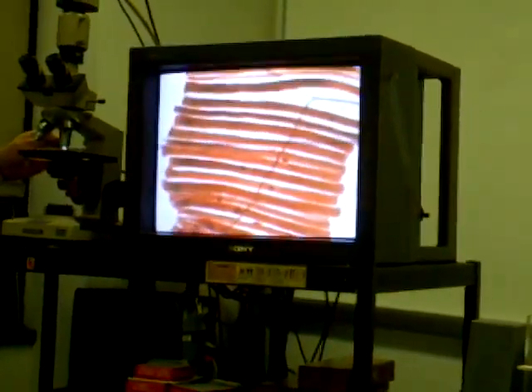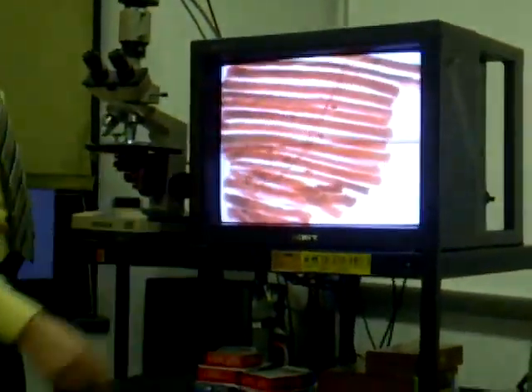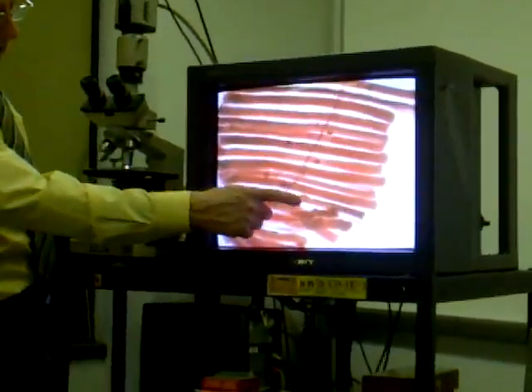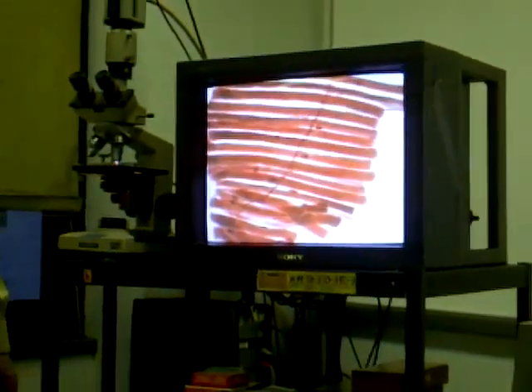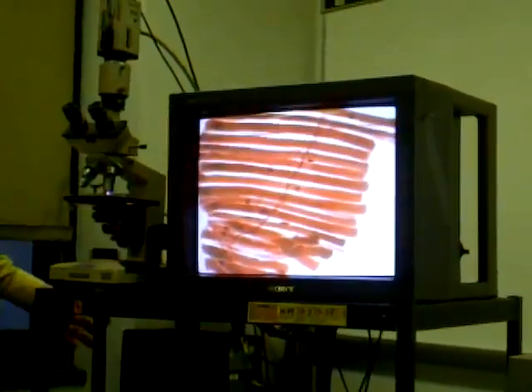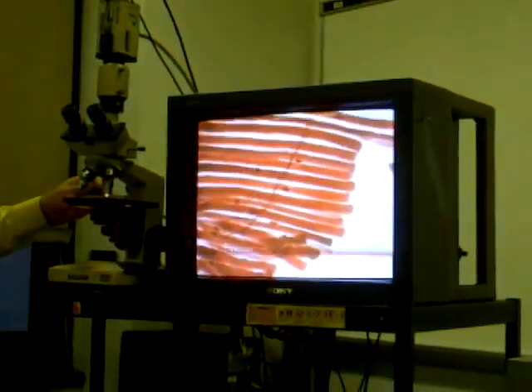So the dots are... Well, these big dots, each one of these is a motor end organ. That's the connection between nerve and muscle. And if you look carefully, you'll notice that each fiber of the muscle has one and only one of the terminal branches connected to it with a motor end organ. It is interesting to see these under higher power.